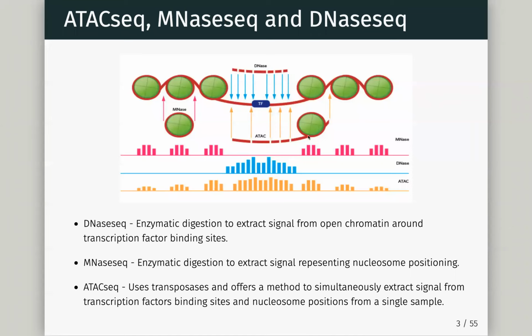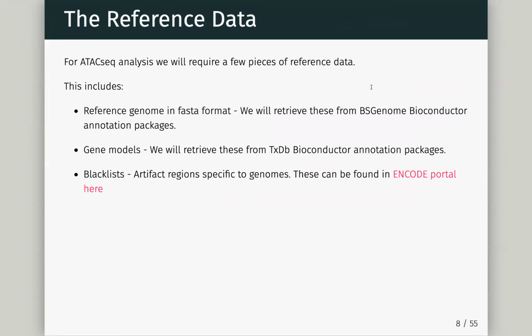So we know how much DNA can wrap around a nucleosome. Right? So by cutting either side of it, fragments which are basically that length, we'll assume came from nucleosomes. If they're packed too tightly together, we won't be able to get in between nucleosomes, but maybe we'll get around 2 nucleosomes. And then the distance of DNA, which is wrapped around them, will be twice. So we should also be able to find fragments which represent that.